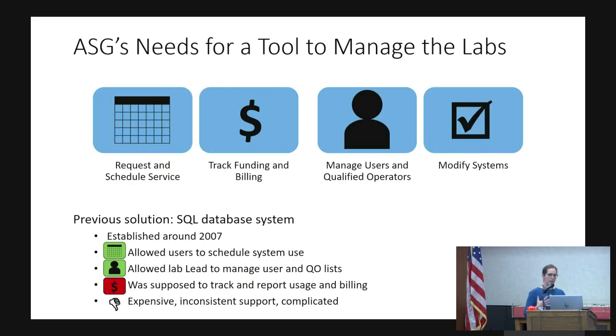So this tool that we kind of decided we needed these 4 main functions to this tool. We needed to be able to request services and schedule these services, use of the equipment. We needed to be able to track both the funding and the billing that's going through, and then be able to manage this large user base that we have and assign qualified operators, and then also with all of our systems and equipment, being able to modify those, add new, change features, that sort of thing.